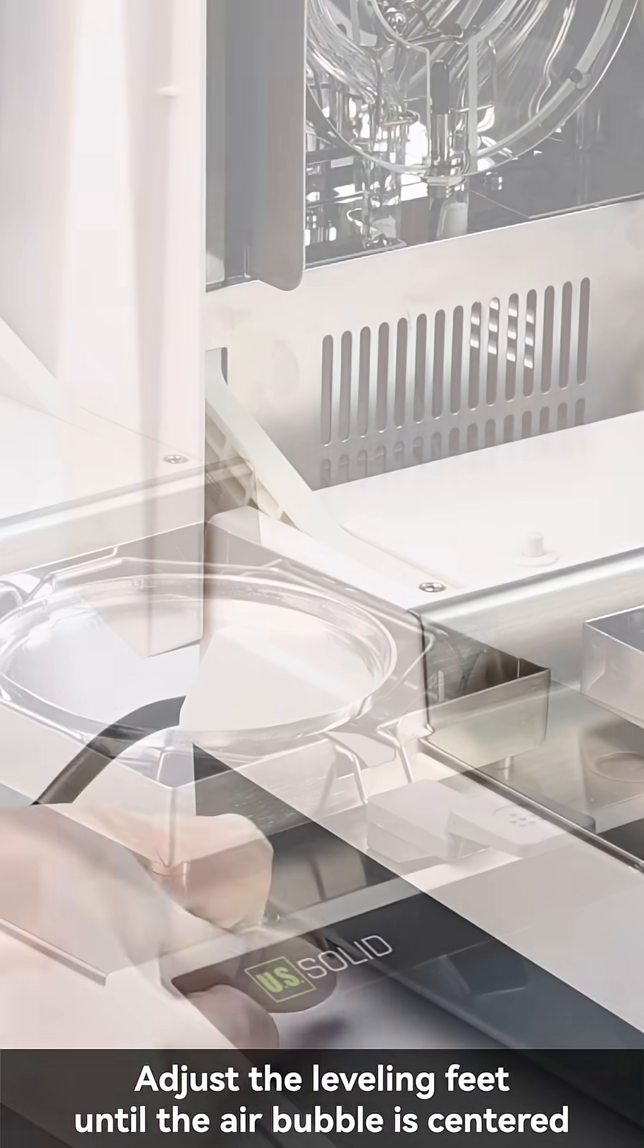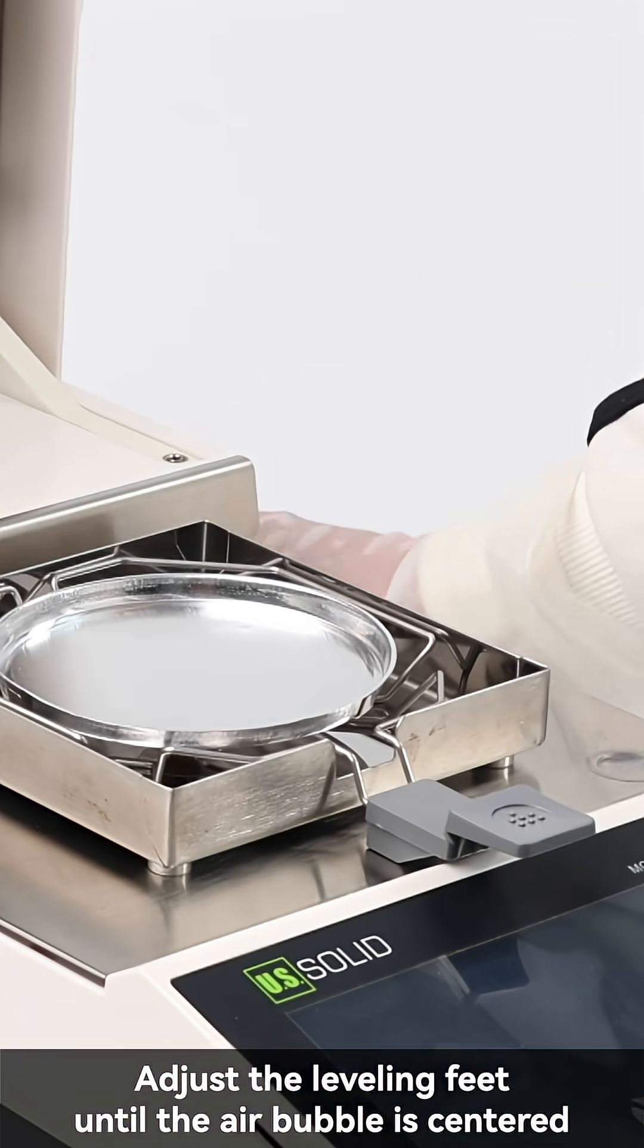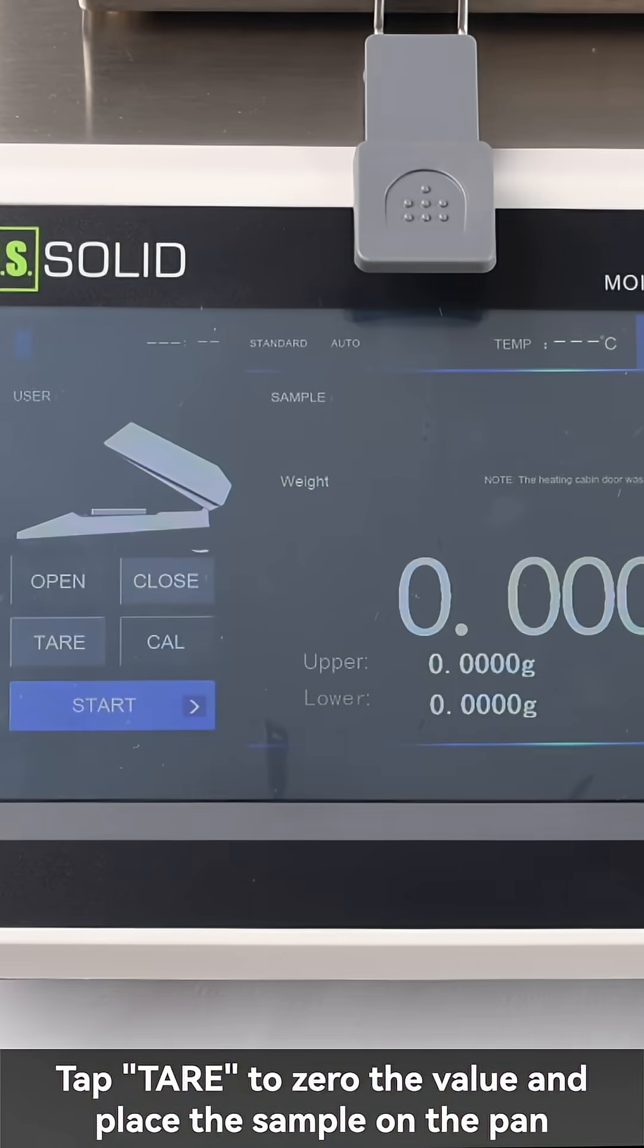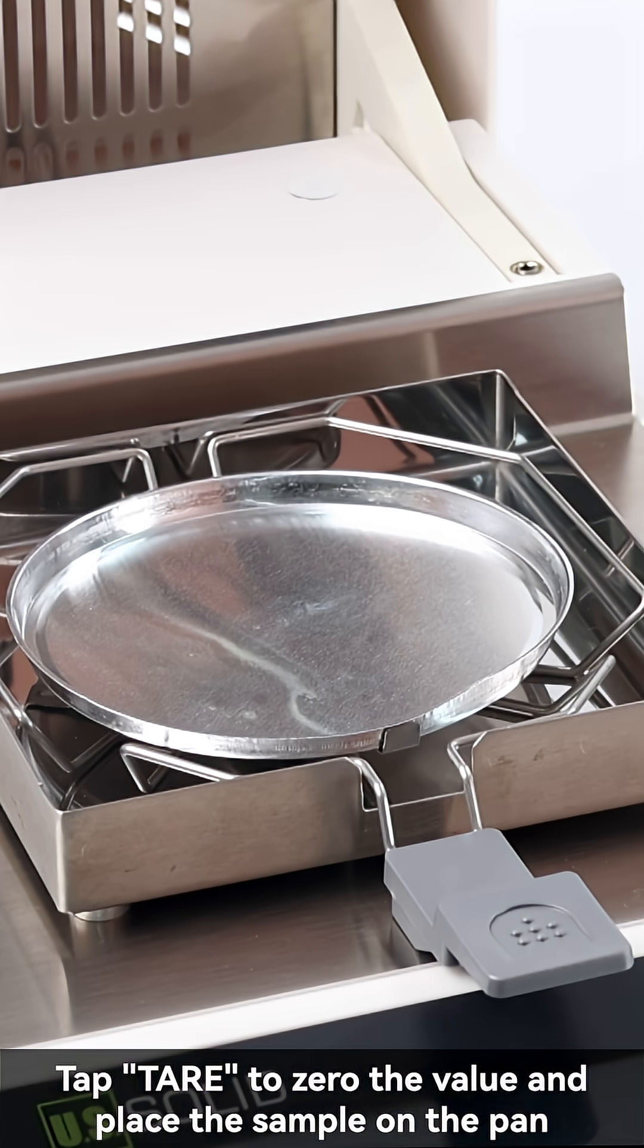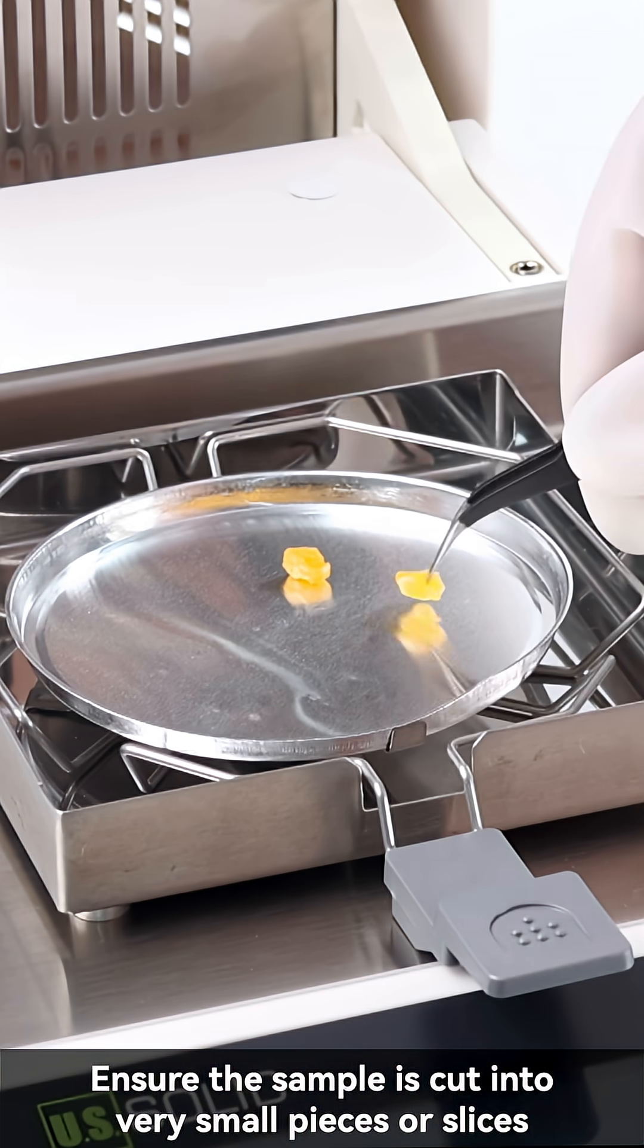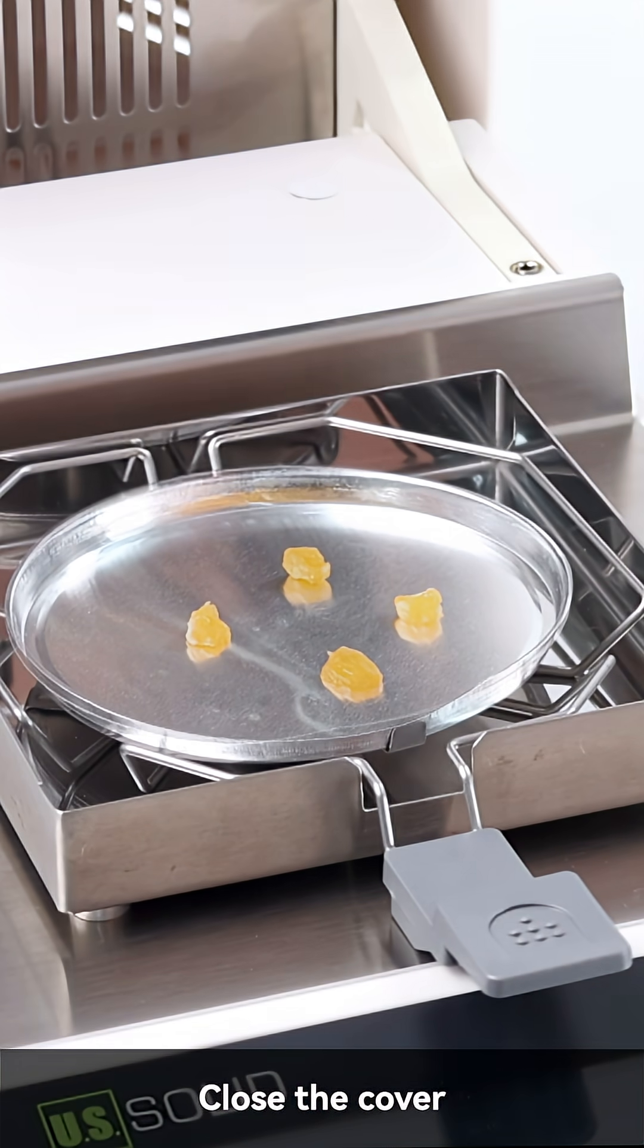Adjust the leveling feet until the air bubble is centered. Tap tare to zero the value and place the sample on the pan. Ensure the sample is cut into very small pieces or slices. Close the cover.